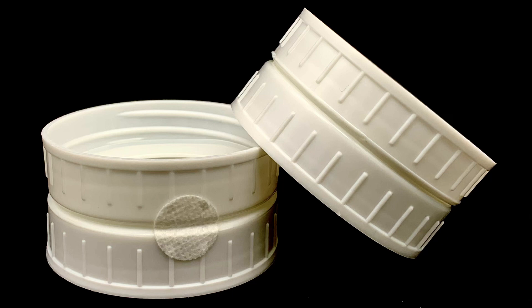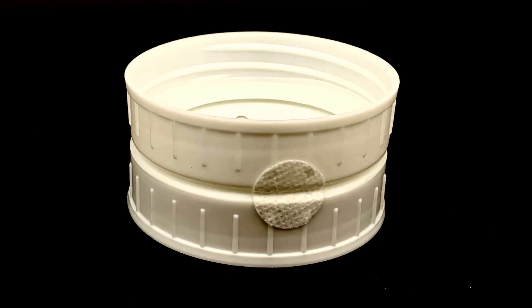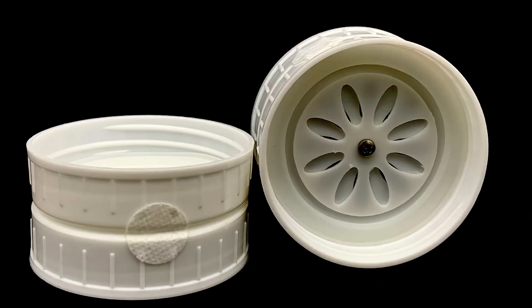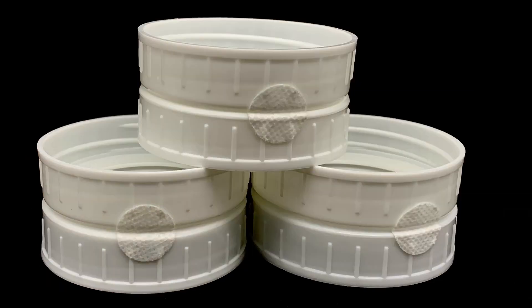The biocoupler meets all the basic requirements and accomplishes all the needed tasks for a fraction of the cost of a traditional Temporary Immersion Bioreactor. It provides the perfect environment for plants to grow without the troublesome plumbing, timers, bulbs, solenoids, etc. And electricity is not required.